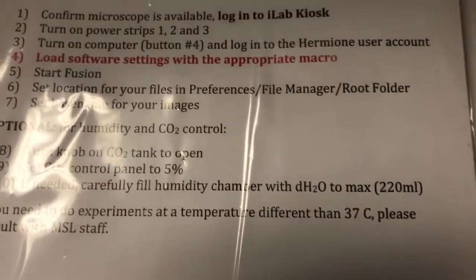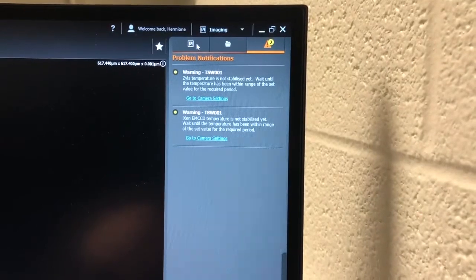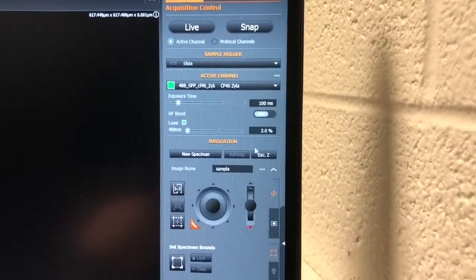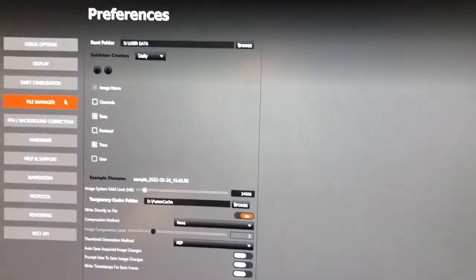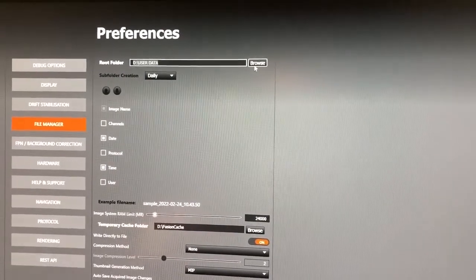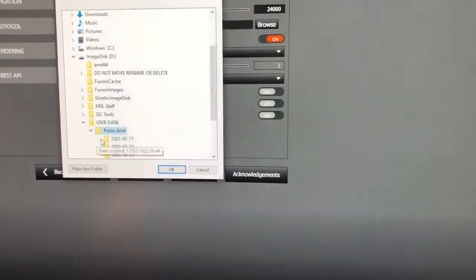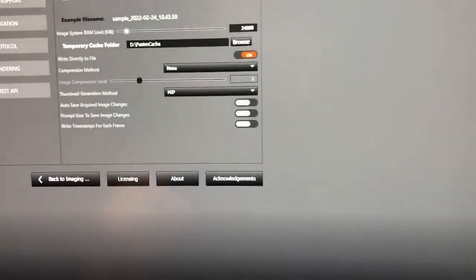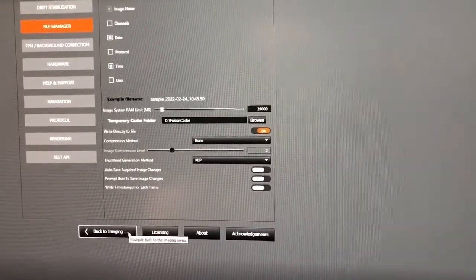The next step in the startup procedure, step 6, is to set the location for your files in Preferences > File Manager > Root Folder. To do that, click here and press this button, which will navigate to the file manager. We're in Preferences, File Manager, and we want to select the root folder in which we are going to place our images. Browse and select your folder, then say OK. That will ensure that all the data created today goes there. To go back to the rest of the software, click here where it says 'Back to Imaging.'